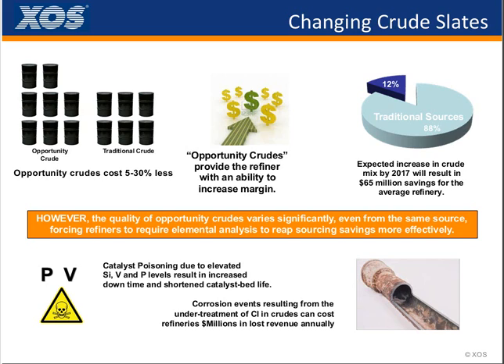I mean, the chloride content can vary wildly when it's sold on the open market. Chloride content is known in some cases, but it's not always. And it's not always an accurate representation. So by the time it gets down to the refiner, understanding what they're putting into their system is critical. And if they can better understand it before they even put it in and get ready for that, then it can help to save them money, it can help with safety, and it can help with any maintenance issues that may occur further downstream.